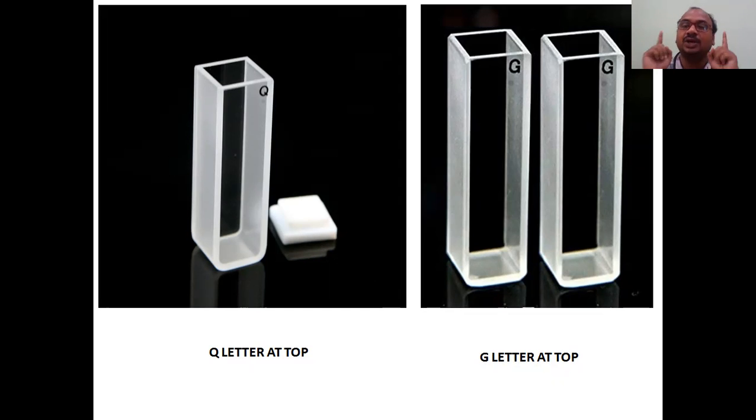Each side is one centimeter - it is a one centimeter square cuvette. When you touch the smooth surface it becomes rough, and when it becomes rough some of the light will be captured by that roughness, causing a disturbance in the analytical result. Always use a visually clear transparent cuvette. You cannot tell by looking alone whether it is quartz or glass - you have to see the letter on the top.